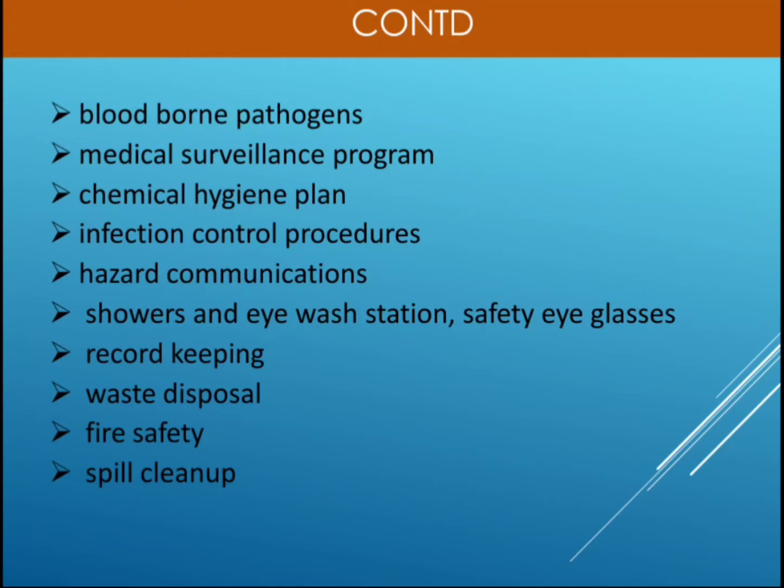Most of the times in the pharmaceutical industries, for fire safety there is a water shower which is placed at regular intervals from distances throughout the campus. Okay. Then spill cleanup means what? When there is a spillage of the specimens, then there should be immediate measures for cleaning up those spills, okay, which are dropped onto the floor, which may cause contamination.